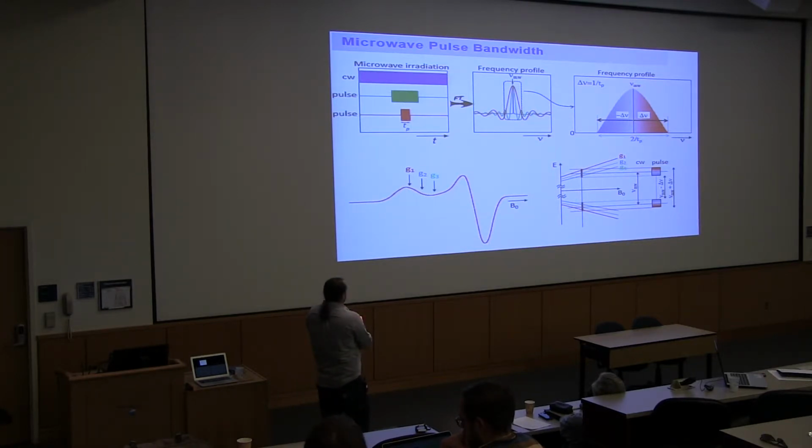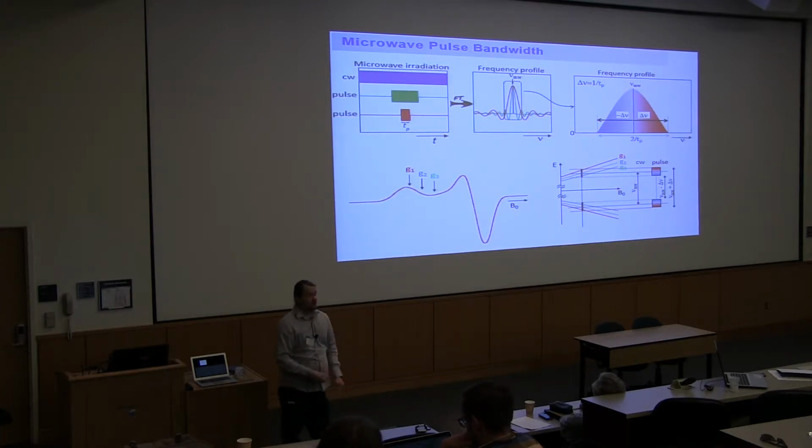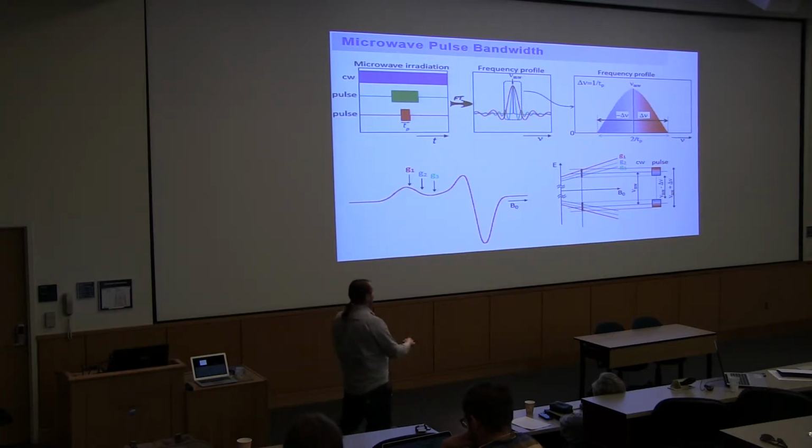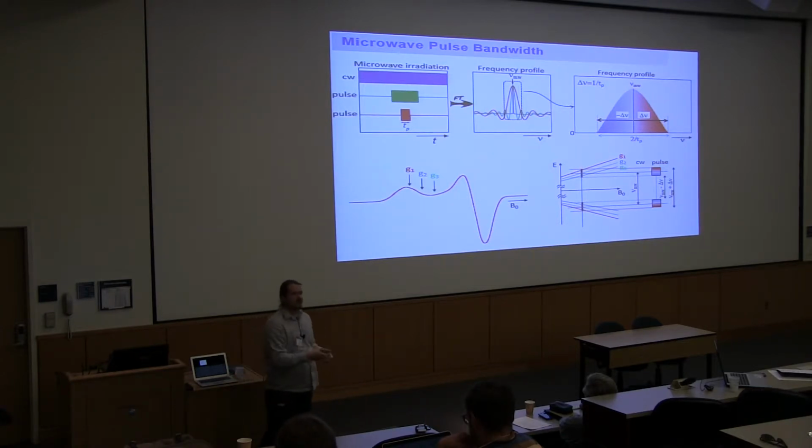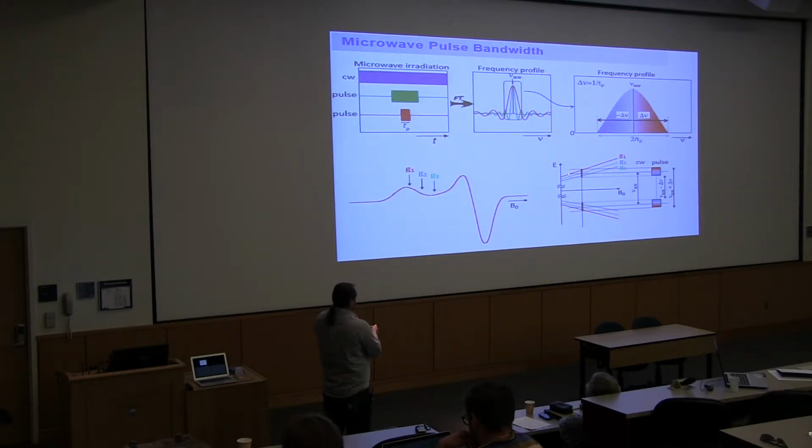And the shorter the pulse, the broader the excitation profile will be. The result of that is that we are not just exciting one particular frequency, we're exciting spins of different frequencies here. For instance, if we have an EPR spectrum, and each point in the spectrum is defined by systems that have different g values, all right? And we would basically go through the magnetic field. We have resonance here, we have resonance here, or resonance here. And that's what comprises these three g values, for example.